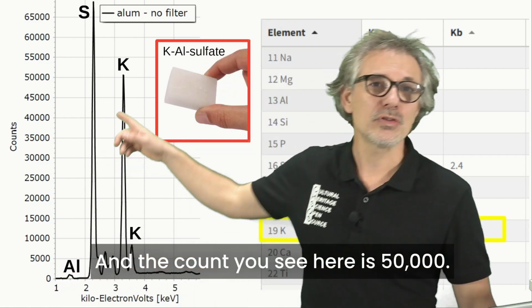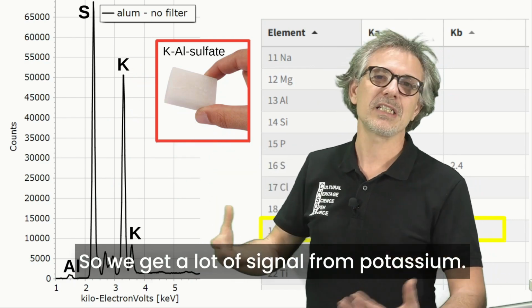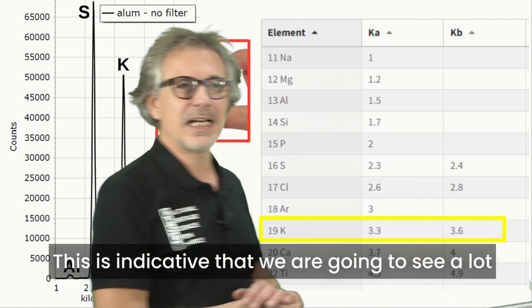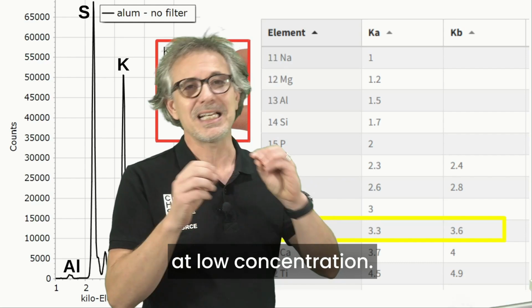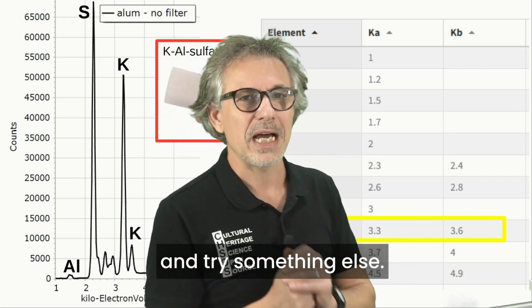And the count you see here is 50,000, so we get a lot of signal from potassium. This is indicative that we are going to see a lot of the potassium even when it is at low concentration. Okay, let's move in the lab and try something else.